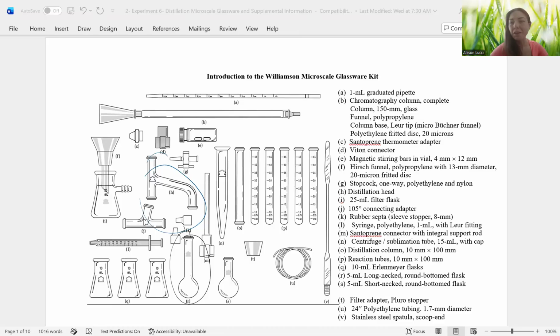Hey everybody, so we're going to continue with our tutorials on fractional distillation on our virtual lab here. So I'm going to move to document number 2. Again, you can access documents 1, 2, and 3 on Canvas. This is document 2 here.